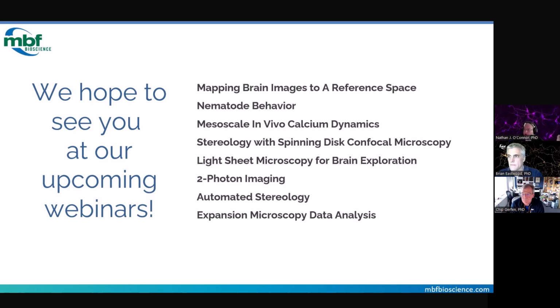We have a few folks doing stereological processing on things that have been automatically registered, and that really eliminates the need to draw regions on tons and tons of sections. So I wanted to answer that one.